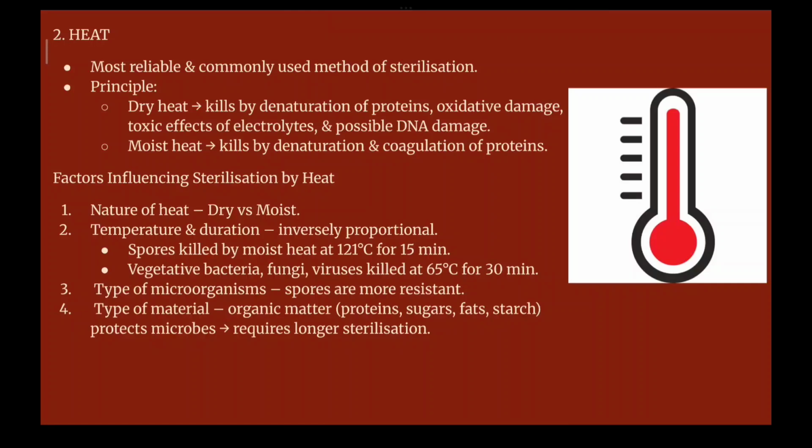The factors that influence sterilization by heat are, first, the nature of heat. It can be dry or moist. Then the temperature and the duration, which are inversely proportional. So whenever the temperature is high, less duration is required for sterilization. If the temperature is low, more time is required to sterilize. So that is inversely proportional.